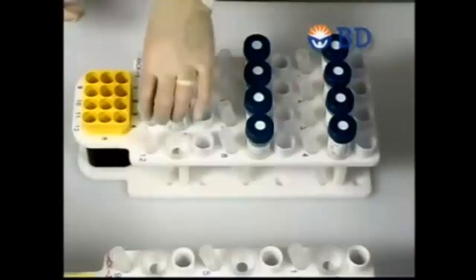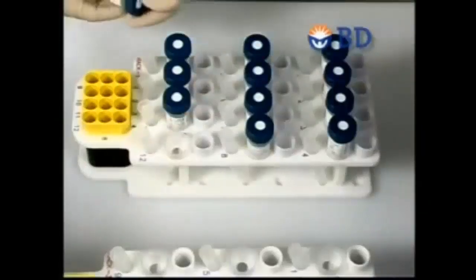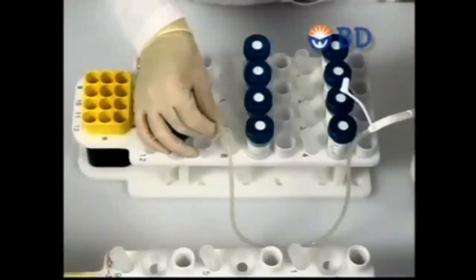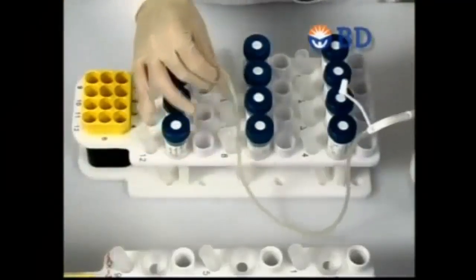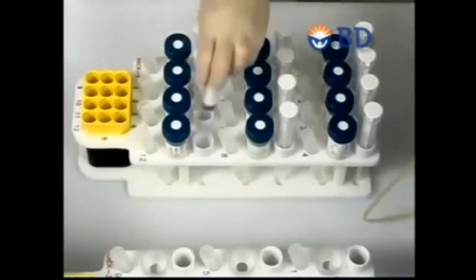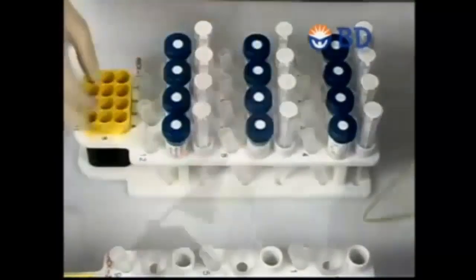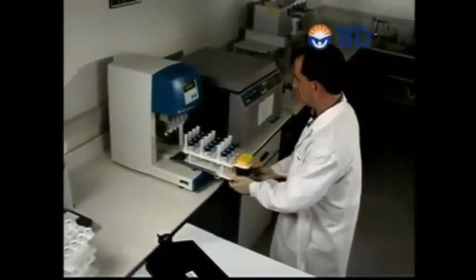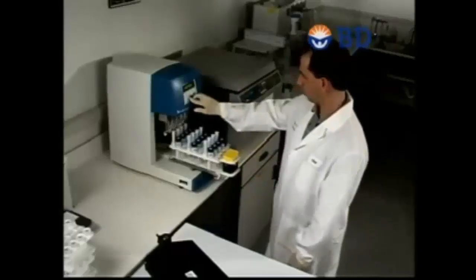A PrepMate rack is loaded with SurePath specimen vials and the corresponding centrifuge tubes. Four milliliters of density reagent are dispensed into each centrifuge tube. A disposable PrepMate syringe is then placed adjacent to each specimen vial, and the rack is ready to be loaded onto the automated PrepMate accessory. The PrepMate accessory automates this phase.